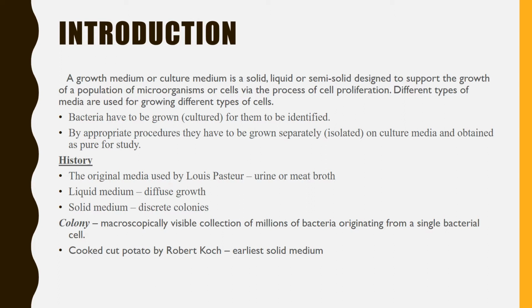So what is culture media? Culture media or the growth medium is a solid, liquid, or semi-solid designed to support the growth of a population of microorganisms or cells via the process of cell proliferation. This occurs at the optimum temperature and in appropriate conditions. So there are different types of media used for growing bacteria and different types of cells.